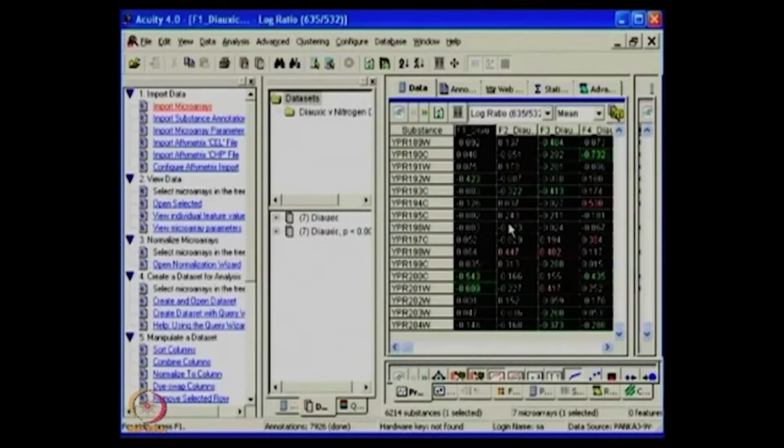Usually differential expression data is logged. The meaning of log to the base 2 is that a log base 2 value of 1 is equal to a twofold change. So a log base 2 value of 2 means a fourfold change, which really becomes significant. You can filter based on different parameters and generate the data sets. Essentially you are reducing the numbers, so you make more sense in the form of visualizations. Otherwise you can also take all the data and do it.